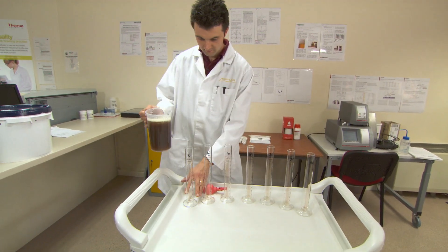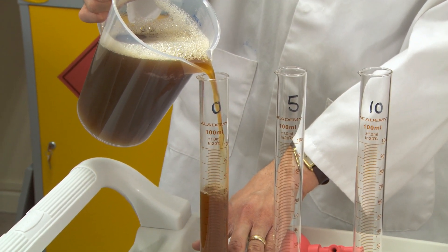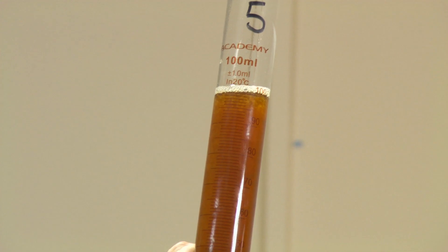Take a wort sample before the end of the boil. Now add this to the finings in your measuring cylinders. Fill the hot wort up to the 100 millilitre mark, then record the wort clarity and the appearance of the hot break.